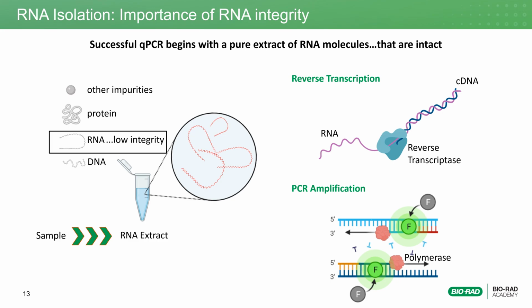If the RNA sample contains breaks in the transcripts of interest, then both reverse transcription and PCR amplification will likely be inhibited. During reverse transcription, the degraded RNA transcript may not be fully reverse transcribed, which has lasting effects within PCR amplification. For example, the fragmented cDNA will not fully be amplified during PCR amplification, which will reduce the fluorescence signal from the gene target of interest.